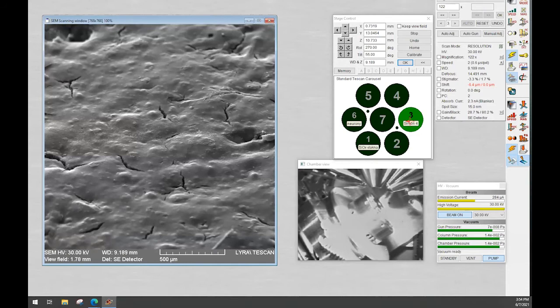Okay. So as the focus ion beam needs a better vacuum, now I will work with this gas injection system. I need to heat the nozzles, the reservoirs, and the capillary as well, which are bringing gases into the chamber.